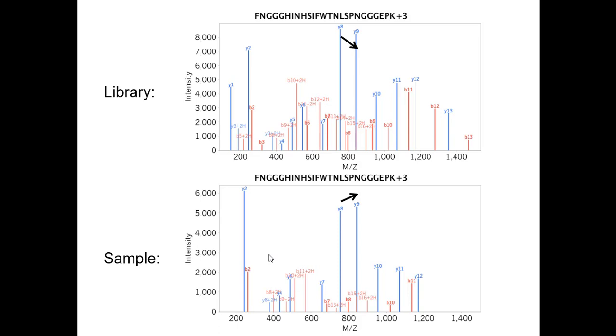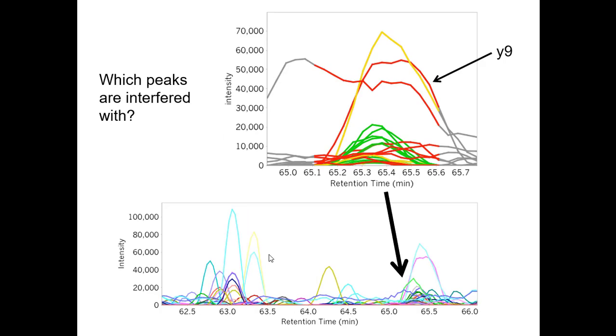Yeah, and that's actually what's going on right here. So if I look at, oh my. It could be another peptide. And so what's going on is if I actually highlight the ions that fit this peak shape, it's actually pretty easy to pick out. Yeah, that actually looks like a peptide, right?